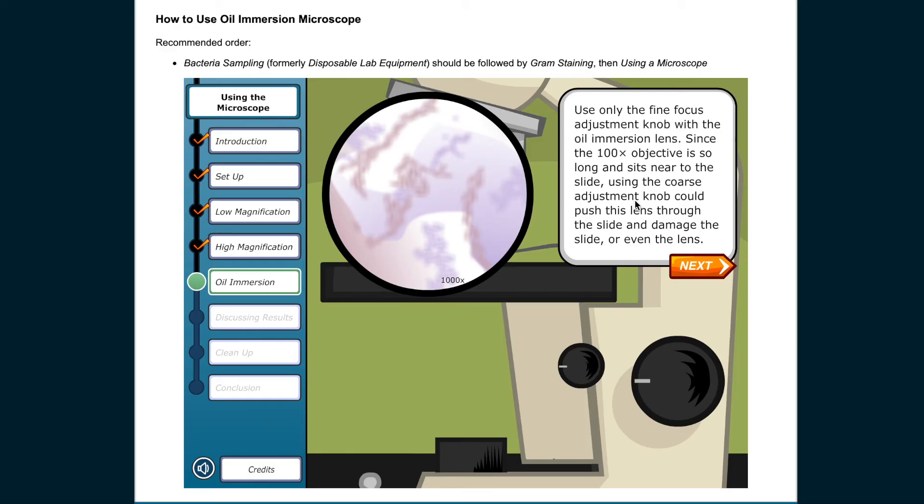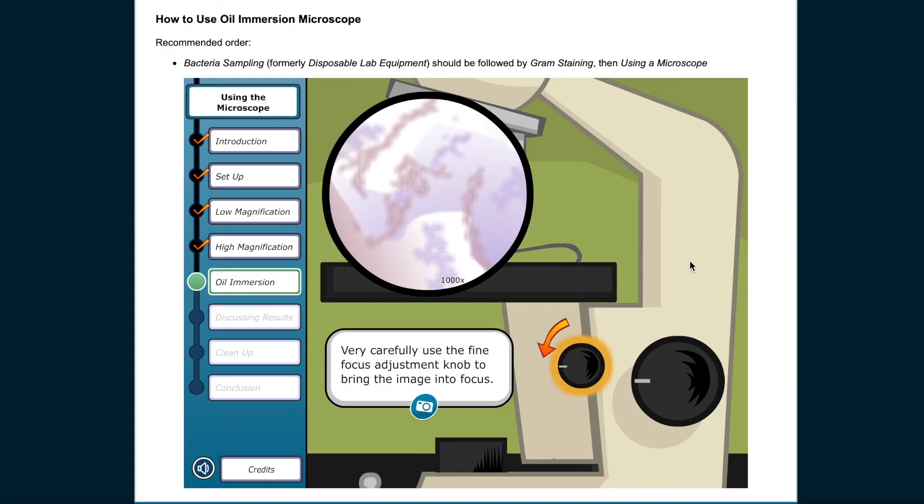Use only the fine focus adjustment knob with the oil immersion lens. Since the 100 times objective is so long and sits near to the slide, using the coarse adjustment knob could push this lens through the slide and damage the slide or even the lens. Use the fine focus adjustment knob to bring the image into focus.